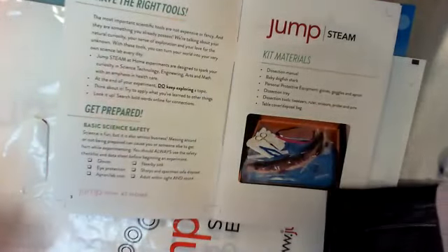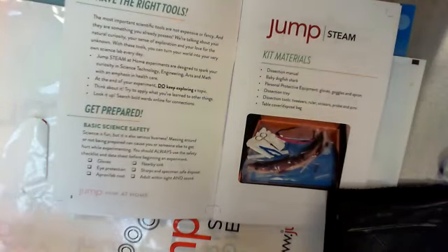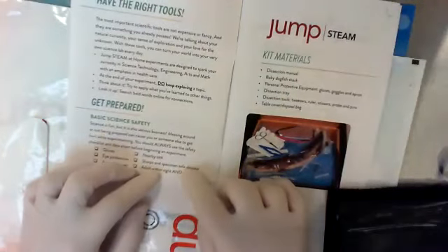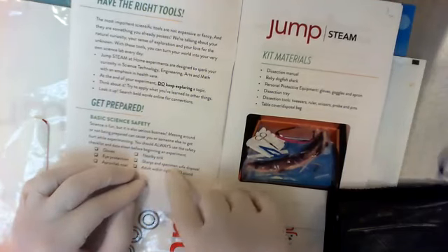Super simple. I hate taking the time to clean, so I just keep myself in a tidy situation all the time so that I can work in a space. And when I'm done, I just roll up the space and pitch it. I don't have to worry about being super clean. I like to be clean, but I don't like cleaning. All right, so sharps, specimen.